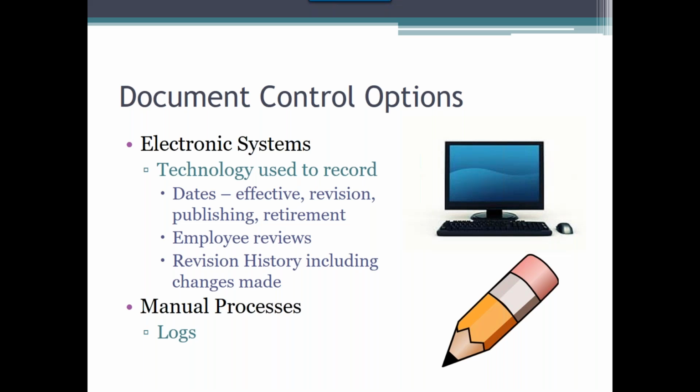When policies are maintained on paper, physical signatures must be obtained for policies and procedures as changes are made. A well-designed document control program eliminates all of the file folders that are tucked away with copies of forms. In an electronic world, policies and procedures are not printed, and forms are only printed as they are needed from the electronic system. With a manual process, there should be a source of truth binder, if you will, where all current versions are housed. Files of documents should not be kept, as this is generally the source of non-current documents being used.